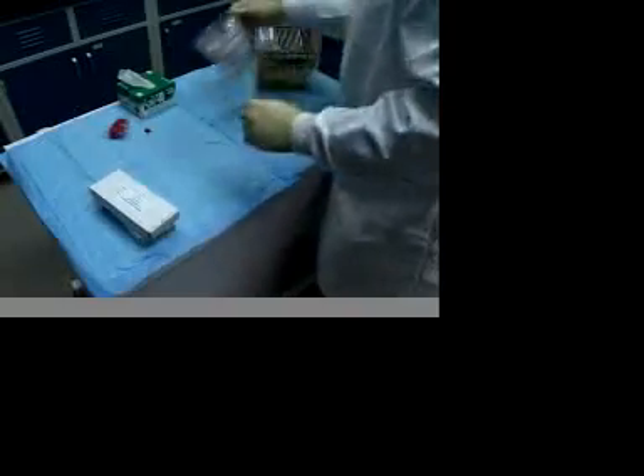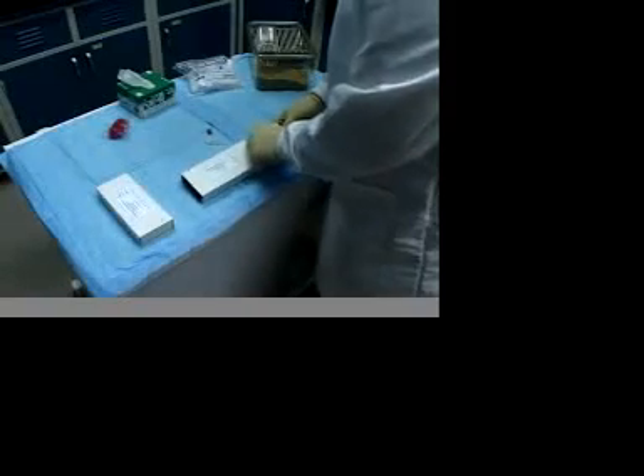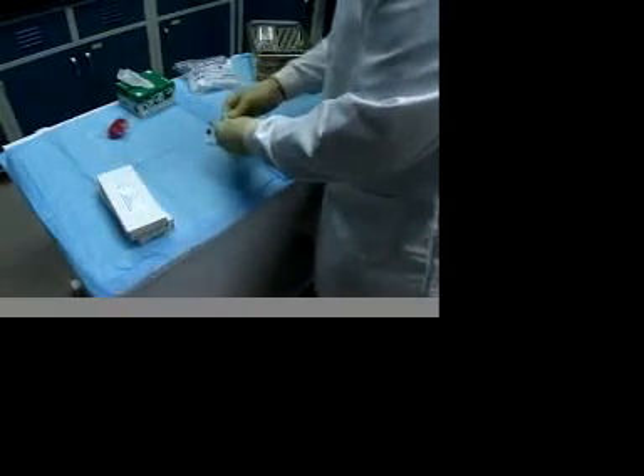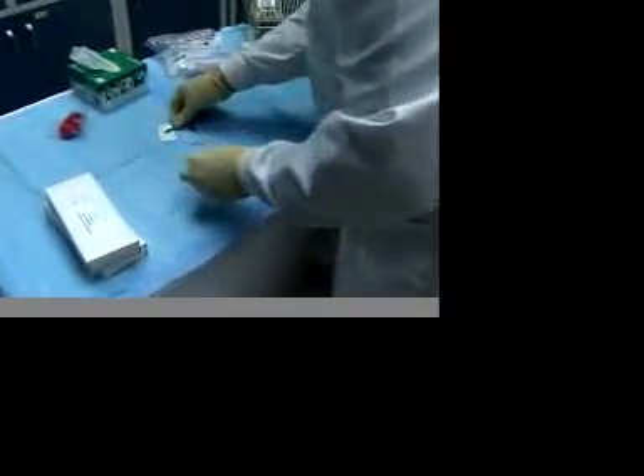To use the Goldenrod Animal Lancet, first prepare a collection vial so that the vial can be retrieved quickly when blood flow starts. Then tear open the individual Goldenrod Lancet wrapper and withdraw the sterile lancet, laying it on the paper wrapper so that it can be retrieved with one hand while not corrupting the sharp sterile point.